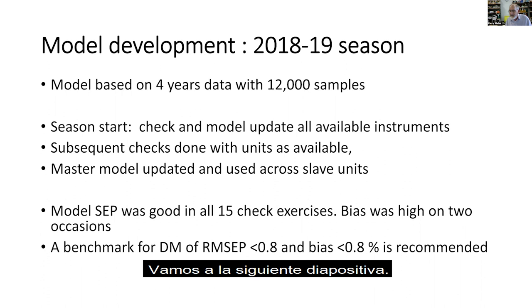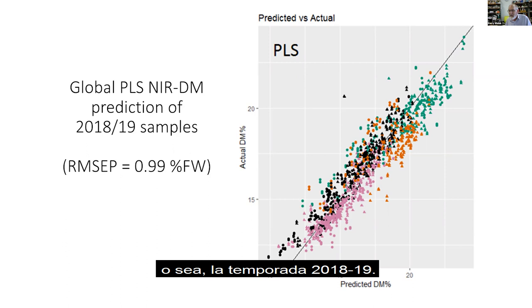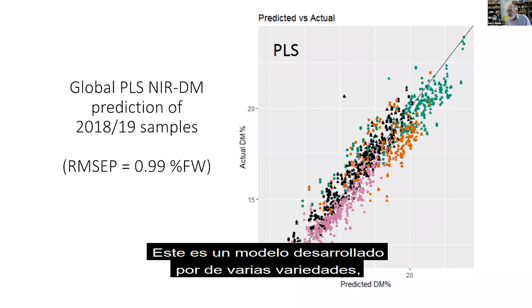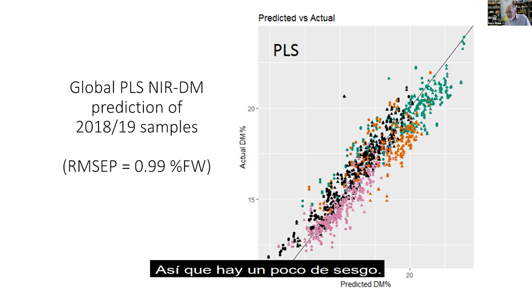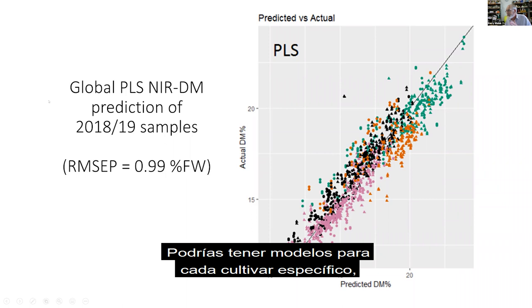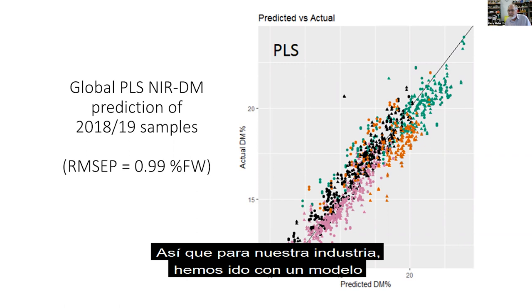Jumping to the next slide. This is the model developed over 3 years and just applied on all of those check populations that were run last season. That is the 2018-19 season. The different colors refer to different varieties. So this is a model developed across varieties, except for Keitt variety, but all other varieties. It's across fruit temperatures and across instruments. So there is a little bit of a bias. You can see that the pink symbols, for example, are a bit lower than the black symbol. So one variety is slightly under-predicting relative to the other. You could have models for each specific cultivar, but that would entail a lot more work in terms of maintaining separate models. So for our industry, we have run with a global model across that range of cultivars.